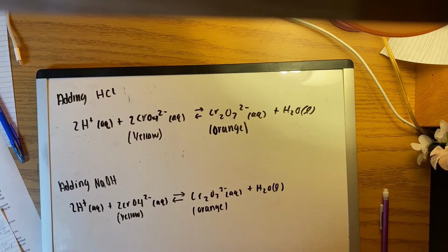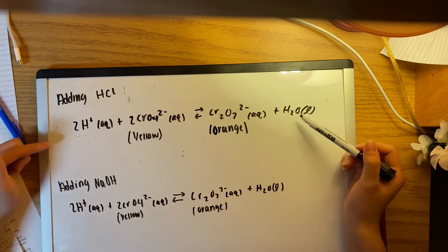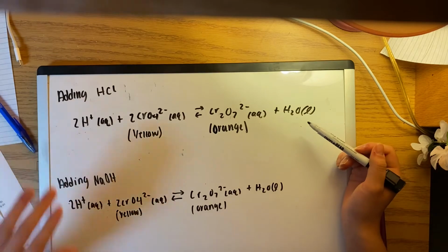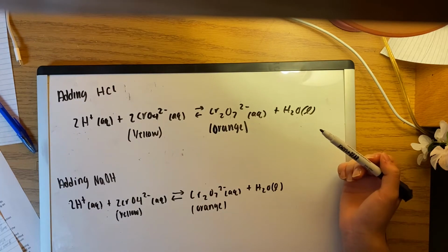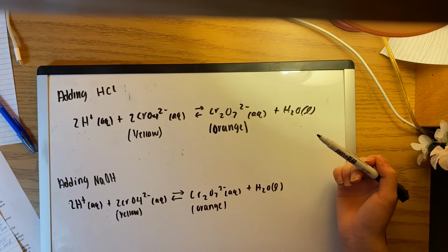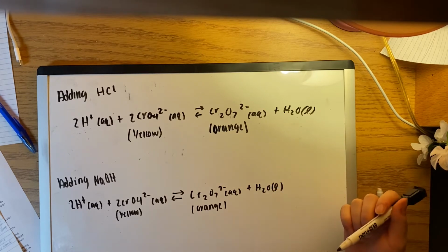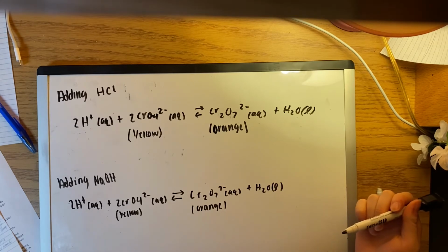The first reaction I will explain is experiment B, a chromate-dichromate equilibrium reaction, by adding a stress of an acid or a base. Before I explain the reaction, both of these equations are considered to be at equilibrium. The initial color of chromate was a yellow aqueous solution, and the original color for dichromate is an orange aqueous solution. When the chromate and dichromate were mixed together, it created a light orange color.